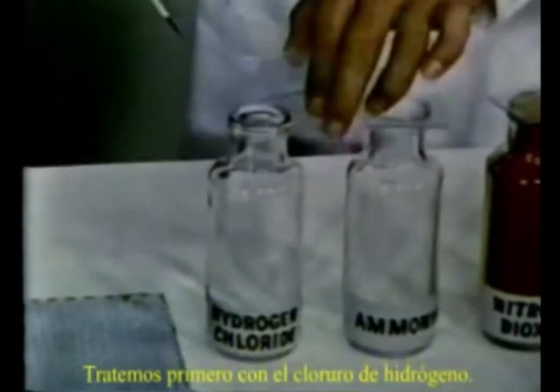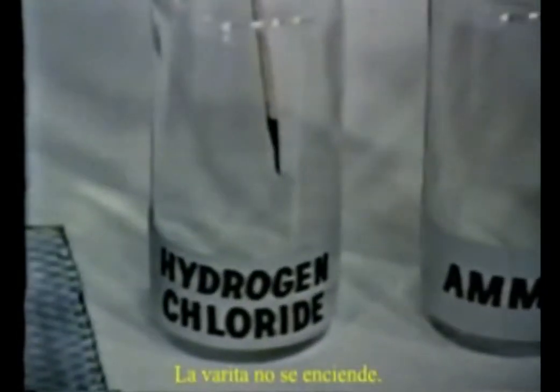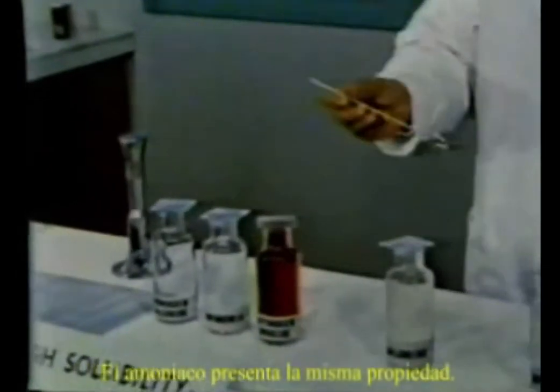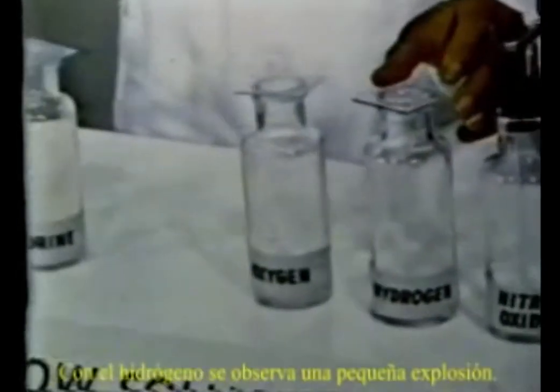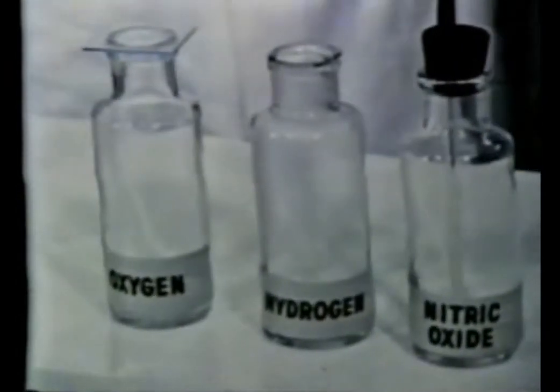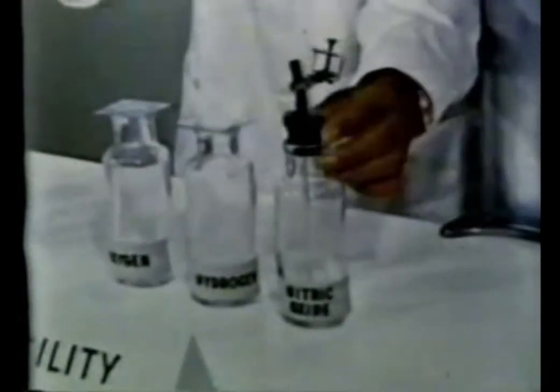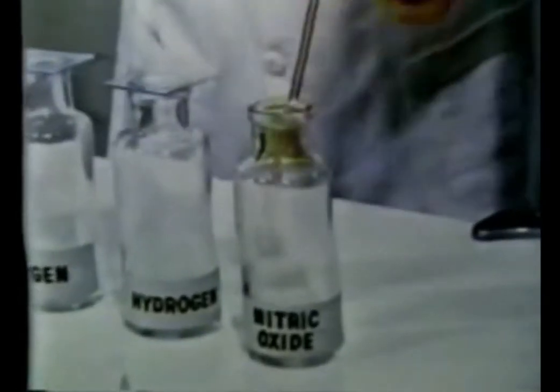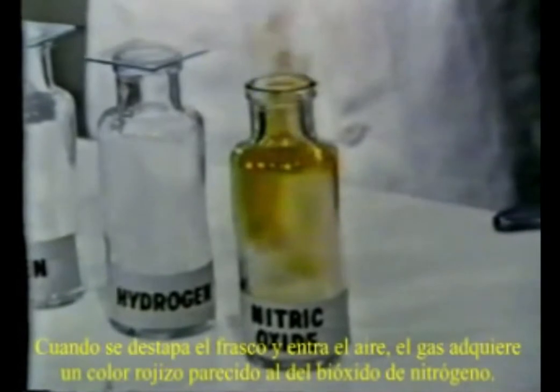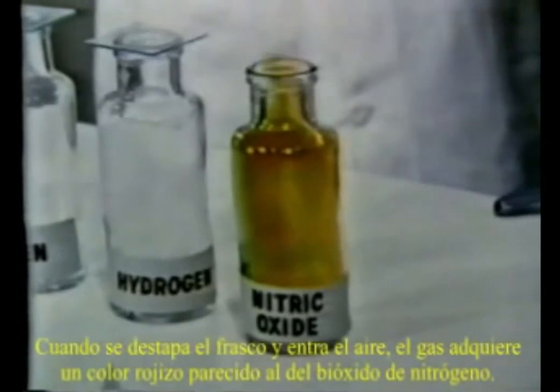Let's try it first with hydrogen chloride. The splint does not burst into flame. Ammonia behaves the same way. With hydrogen, a small explosion. Let's try nitric oxide. What's this? As air enters the bottle, the color changes to a reddish brown, like the color of nitrogen dioxide.